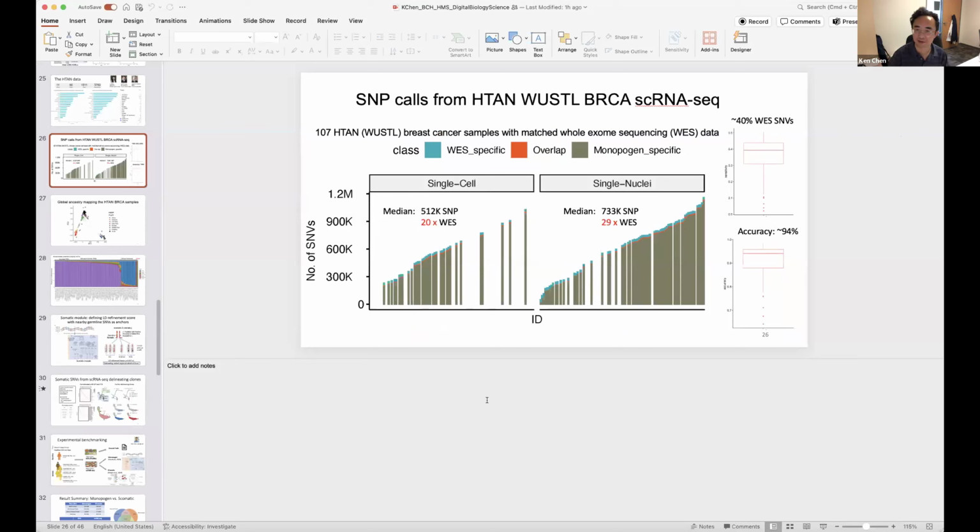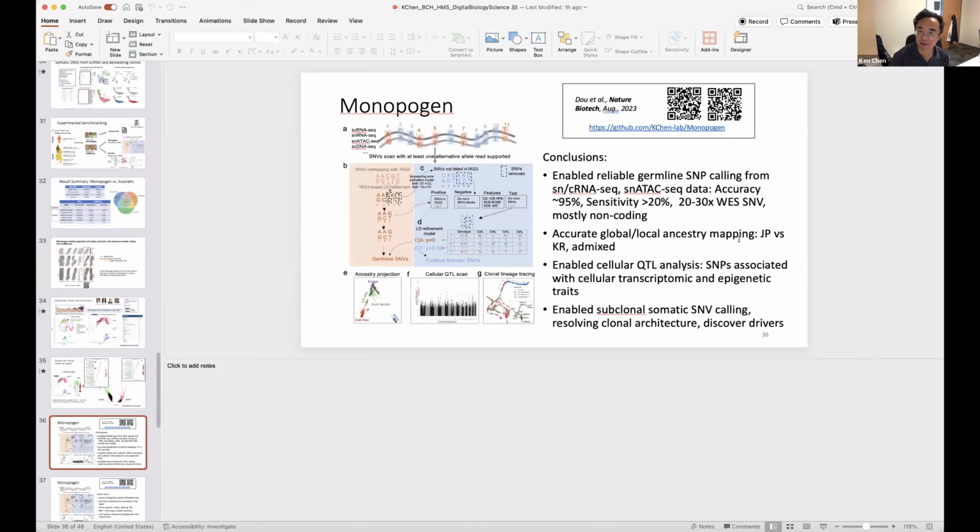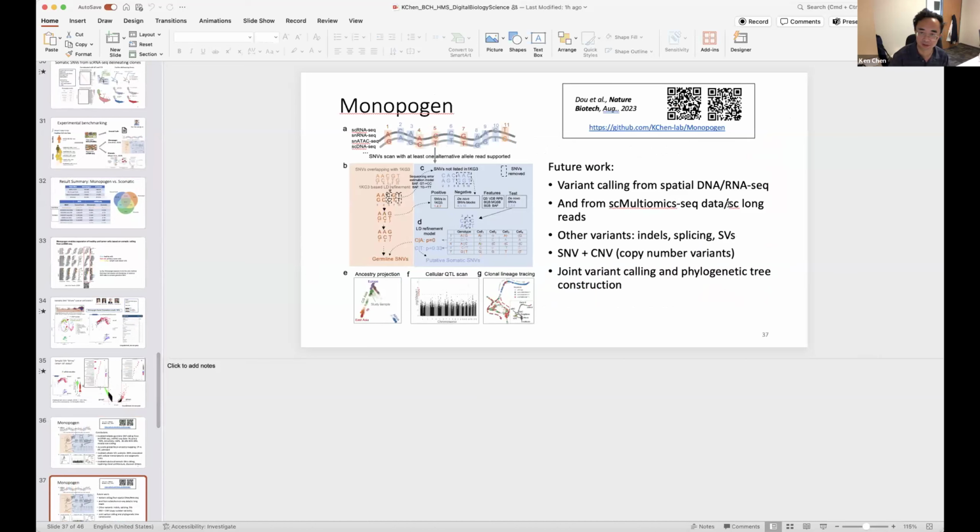What's the other technology, the whole transcriptomic? Yeah, I just wonder if you are also considering applying this to those long read single cell technologies. Yeah, long reads is definitely one thing we're applying to, or have started trying to develop this into. And even for SmartSeq, yeah, I was trying to refer to SmartSeq.